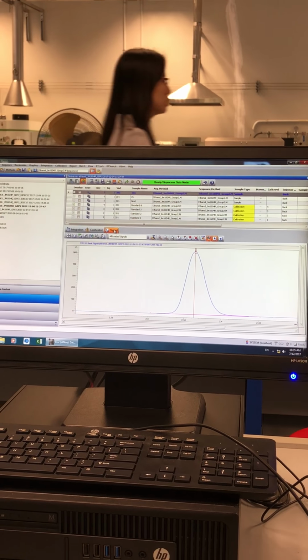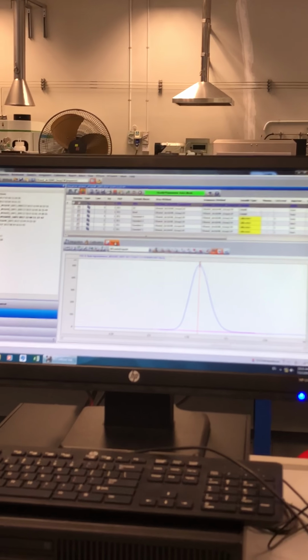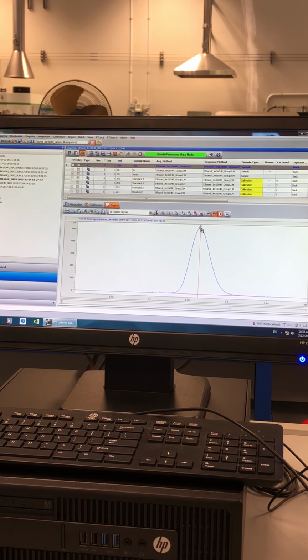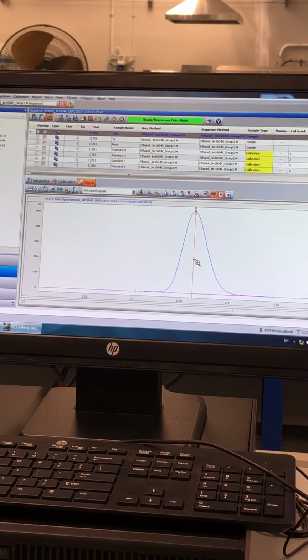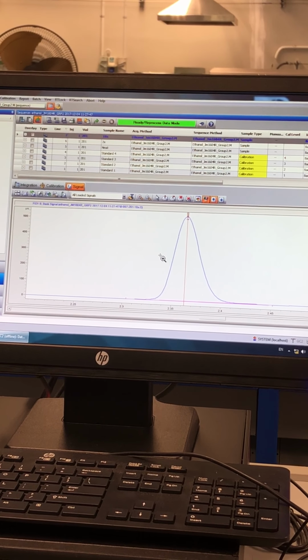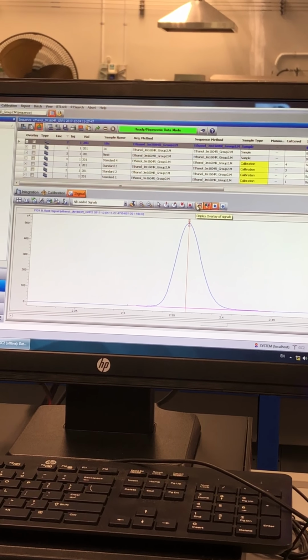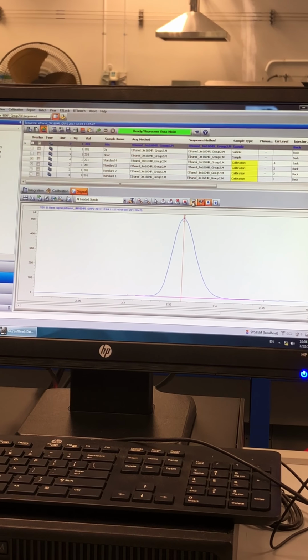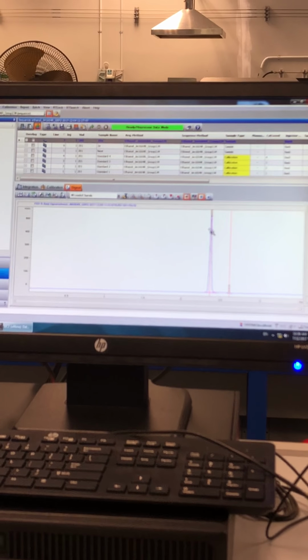Signal. Highlight, tick. Click on the signal, and then you will see a bar of icons. There is one icon with 3 colored circles overlapping one another. Can you see that? Click on that button. That button is actually the overlay button.